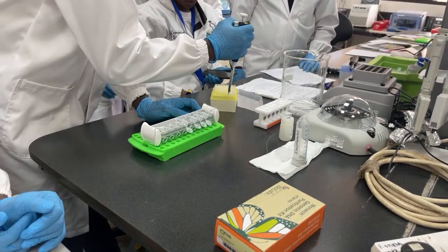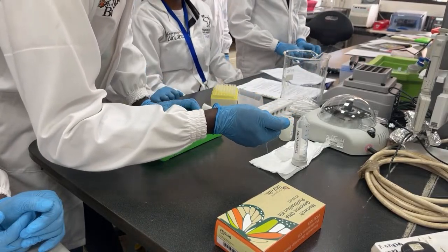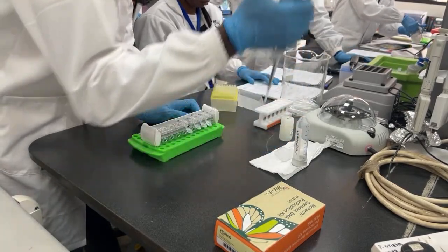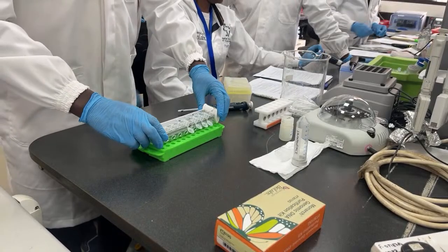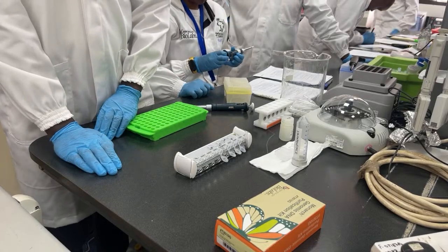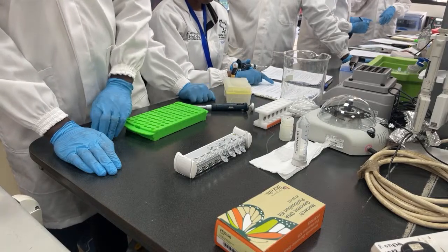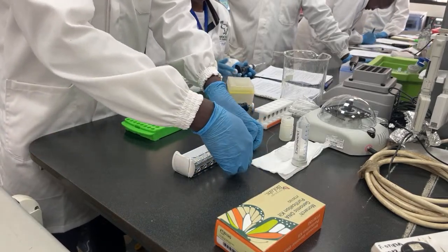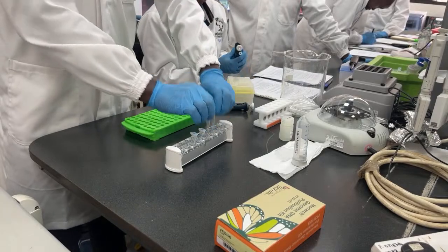In the meantime, everyone take the new 1.5 tube and add the elution buffer to the tubes. It says new. Oh, okay, I'm looking at a different one. It's fine. We'll add the elution buffer to the same tube, but just do the spin again. Close and go and do it. Do the spin again. So you can take them and go to the spin again.